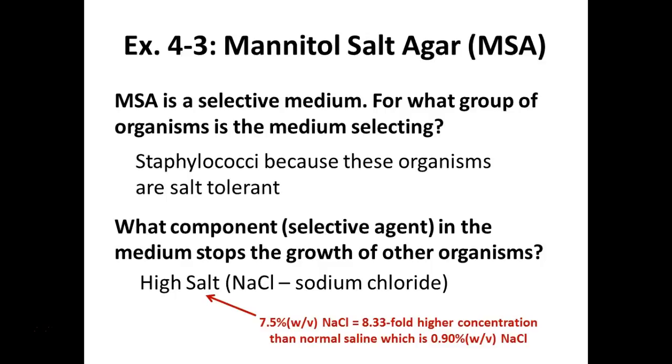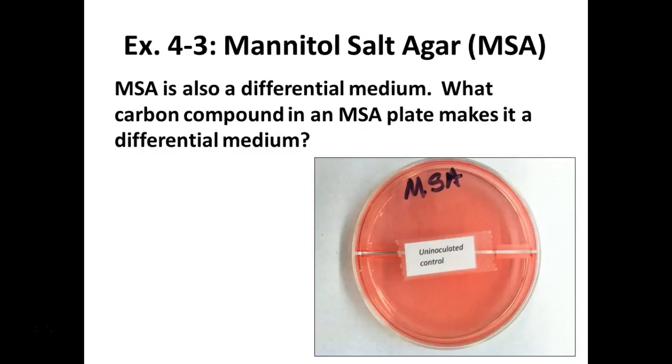This is much higher than normal saline, which is around 0.9%. This is 7.5% salt. This is very salty. When these plates start to dry out, you see salt crystals forming. There's so much salt in them. So these guys start out this nice, pretty pink color.